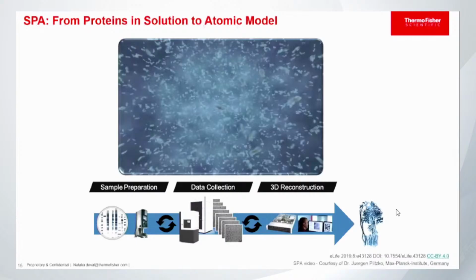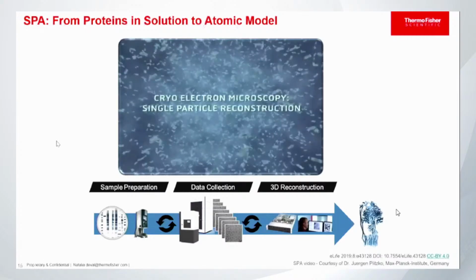So the more difficult part is still, the bottleneck is still the sample prep. Okay, we are working very hard with different systems to make this in a more accurate way, in a way like can be much more reproducible, but it's still complicated. So it's still the bottleneck of the technique. But let me show you this tiny video. I can explain to you how it works.